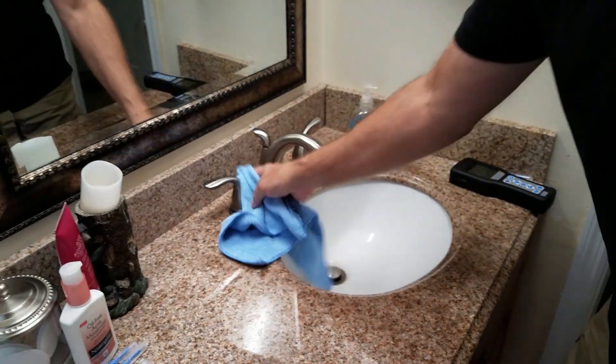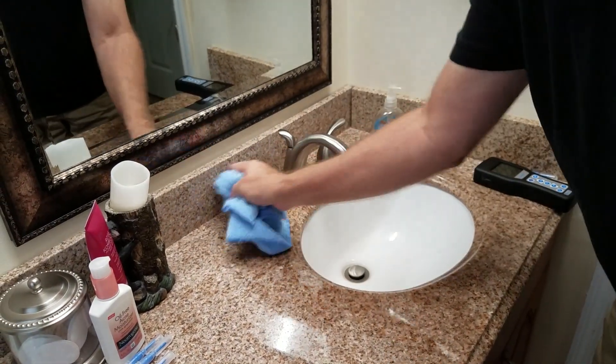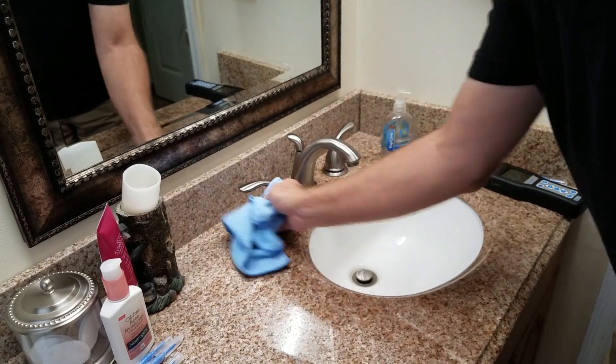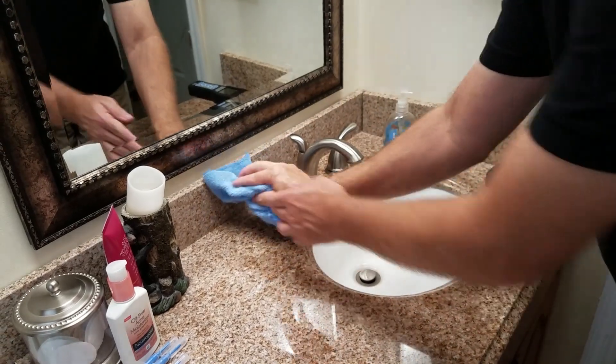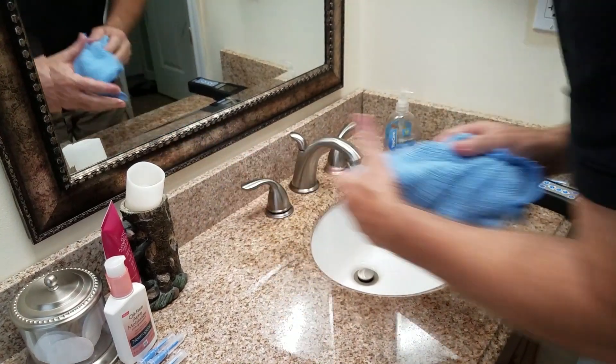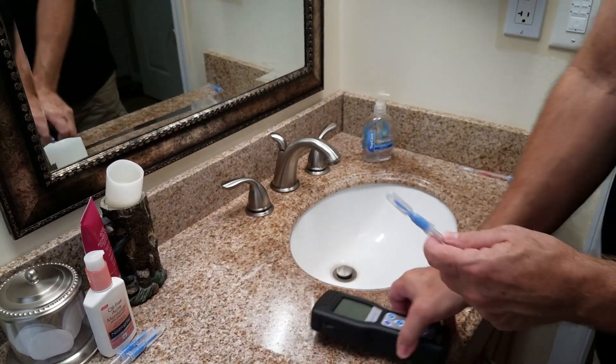It doesn't hurt anything, doesn't hurt surfaces. But this is a product that cleans much better. Dry it off and we'll see how much better of a clean you can get.